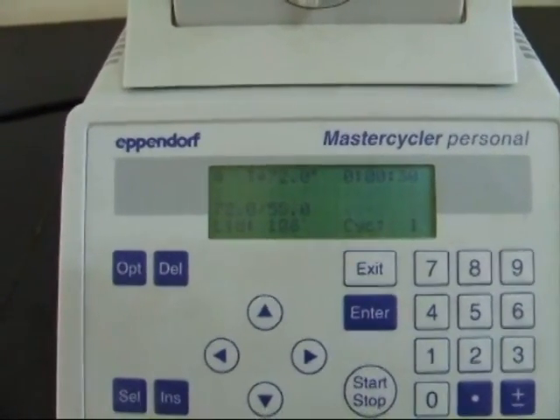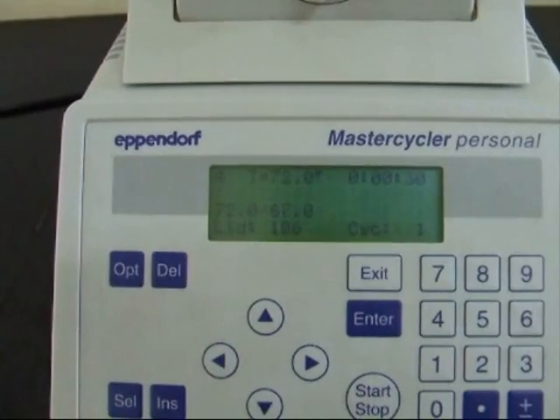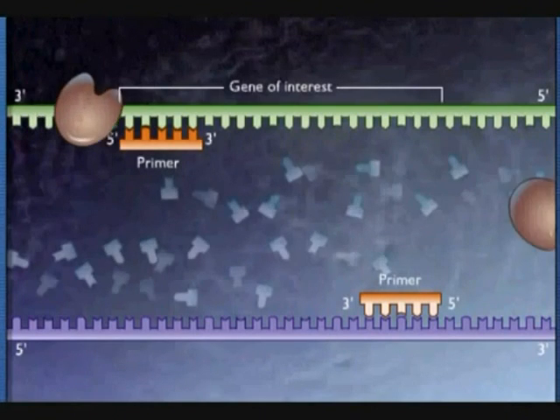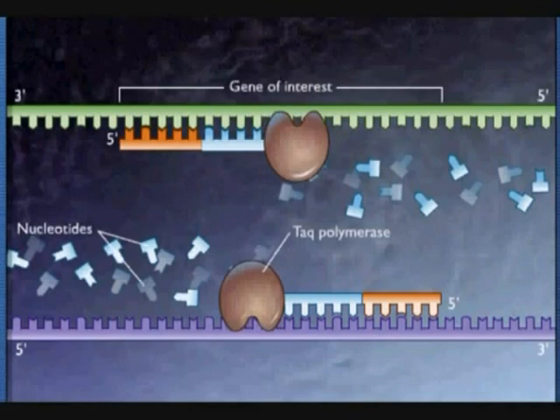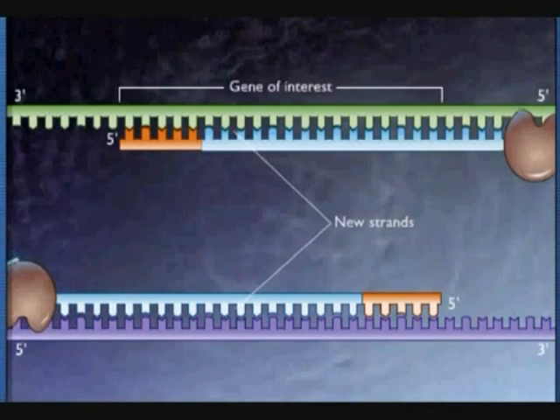After the annealing, we have an extension step at 72 degrees centigrade for 30 seconds. During the extension, the Taq DNA polymerase binds and extends the primer, thereby creating new strands.